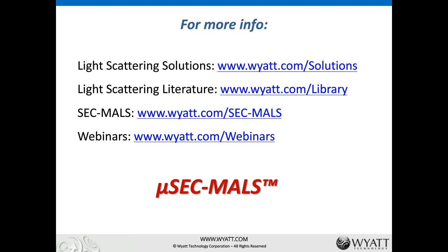So there are two different radii that we have mentioned in the webinar. Let's review a little bit. RMS is the root mean square radius. Basically, that's a way of measuring how the mass of the molecule is distributed. If you think of the molecule as a solid sphere, the distribution is uniform throughout the whole sphere. The root mean square radius would be about 78% of the way from the center of the sphere. That's because on average that's where all the mass is located as far as the sphere is concerned.